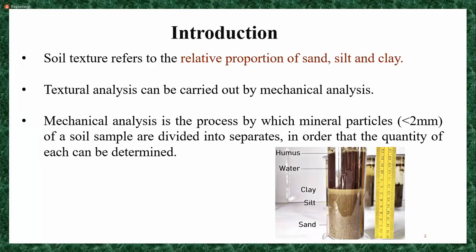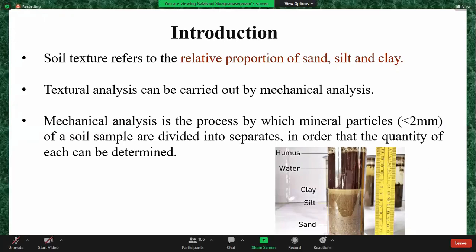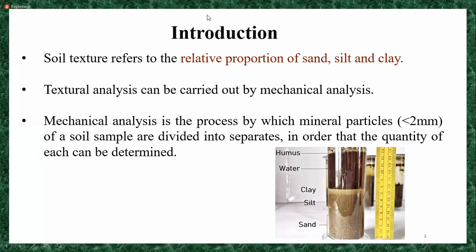So can you tell me what is the advantage and disadvantage of field method? Not accurate. Okay, that is one disadvantage.